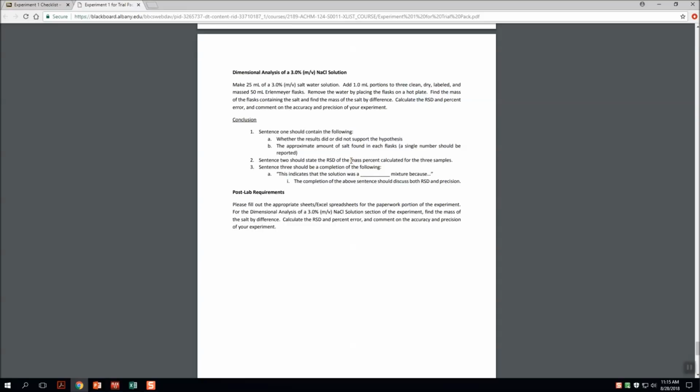Of course, what actually happened is experimental error. Trying to weigh out 30 milligrams is foolish. It's way too small of an amount to measure out. So you're asking yourself, why did we have you do this? Well, this is about accuracy and precision. We don't want to give you something that's perfectly accurate and precise on the first try. So we give you something where it's very difficult to have good accuracy and precision.